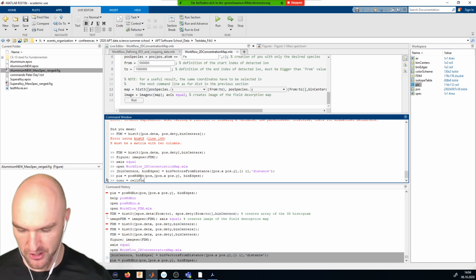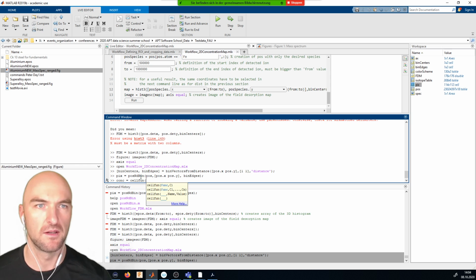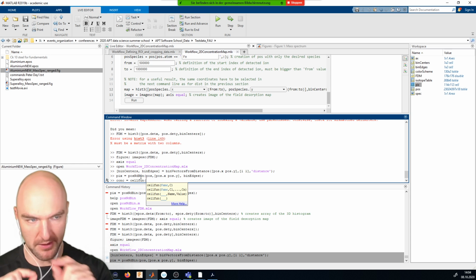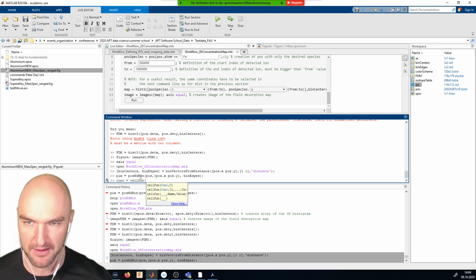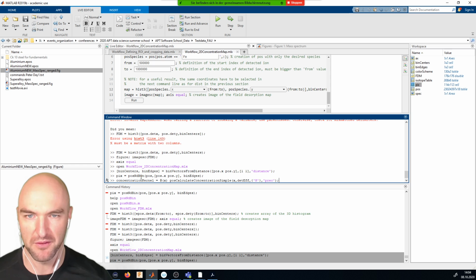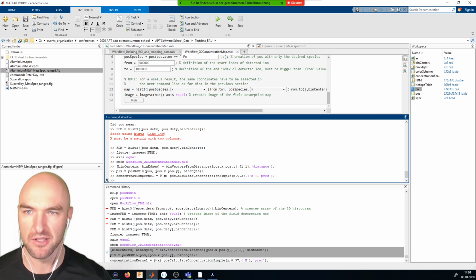So this is a function that applies another function to the parts of a cell. So it will go through each cell and evaluate that function. And now I remember that since I switched off MATLAB, our concentration kernel needs to be redefined. So it doesn't exist right now, so we'll just redo that.